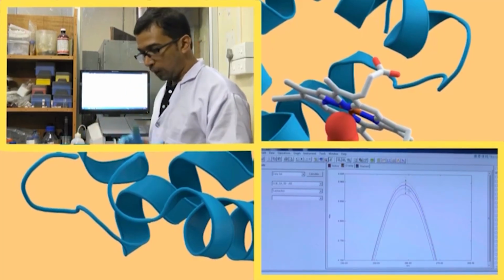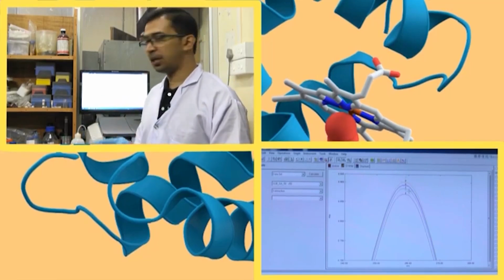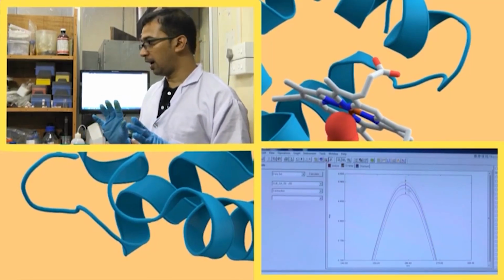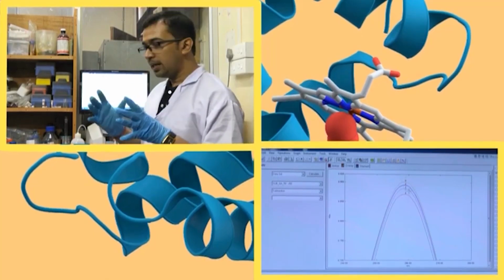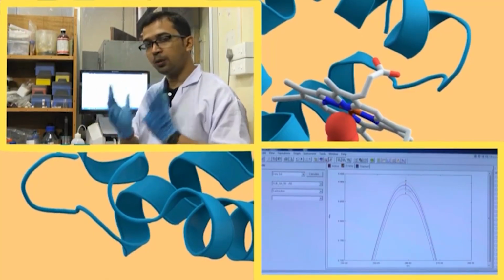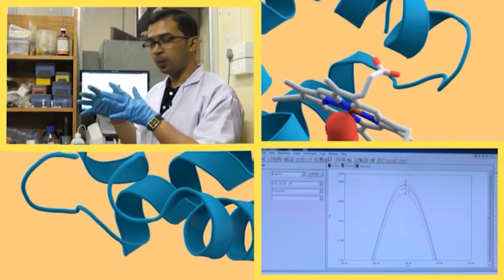Okay. So, what is happening here? Gallic acid is actually soluble in water, we all know. Solubility has some issues, but it is soluble to a better extent than curcumin. So, when it is soluble in water, more or less most of the gallic acid is actually distributed homogeneously in water, and it is showing absorbance.